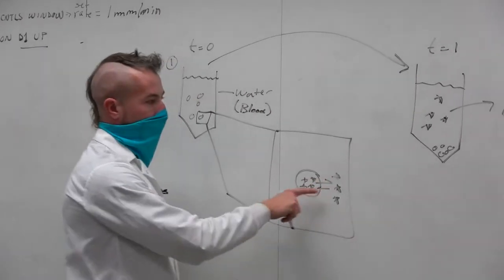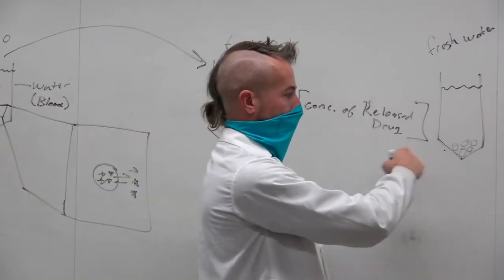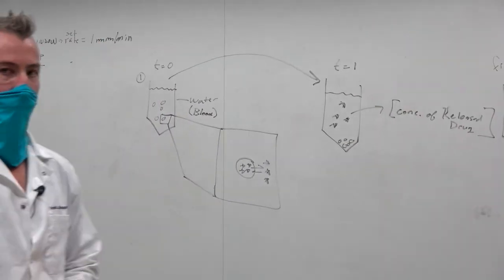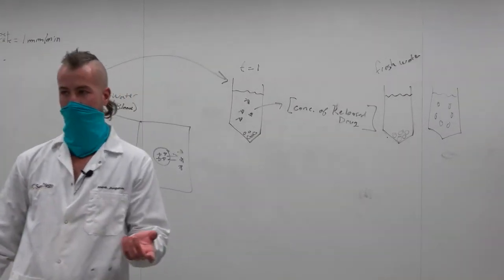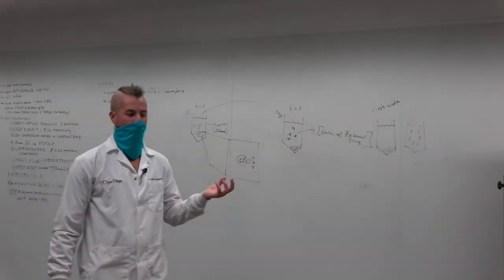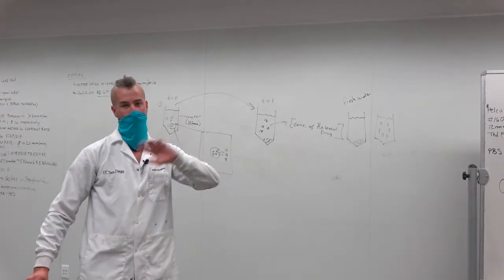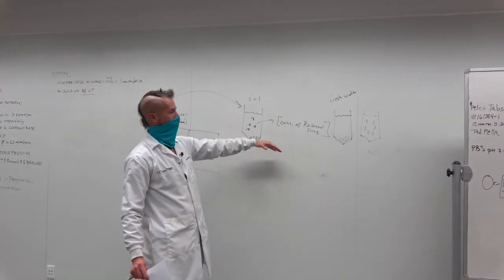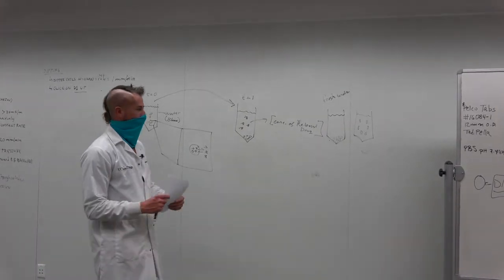And so there's going to be again some diffusion. We're going to again spin it down. We're going to again measure the supernatant. We're going to again resuspend it in fresh material. So this is trying to simulate what happens whenever I inject particles into a person or a mouse, and the mouse is drinking water and peeing water. There's in and out, right? There's an equilibrium. And so this is the notion of fresh liquid going into that living system. Okay?